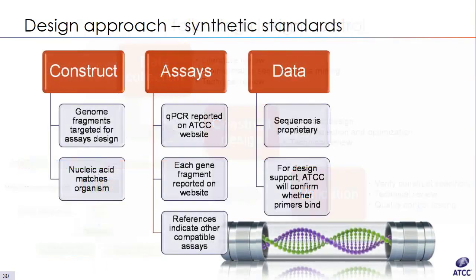There are a number of questions that we commonly field at conferences and through our technical service department, and before I move on, I'd like to answer a few of them. The synthetic standards are small, typically less than 5,000 nucleotides in length. Because of their size, in most cases, they do not include entire genes, only gene fragments. There's enough sequence there for assays to function, but the amplicon size may not always match what you'd find from a wild-type genome.